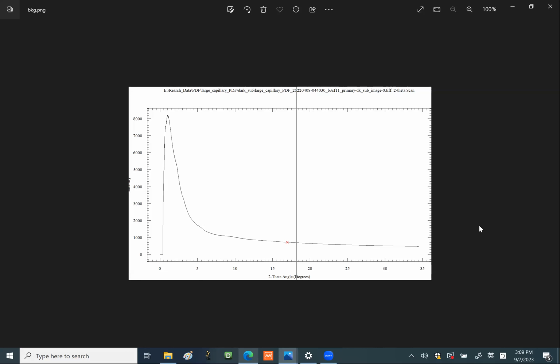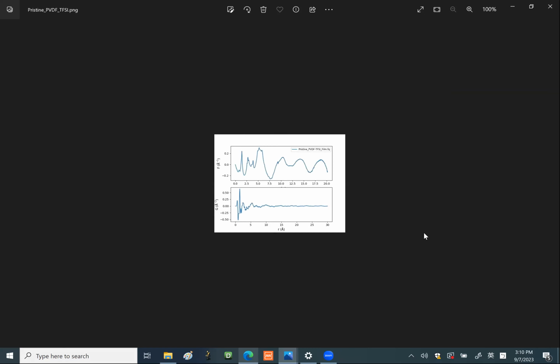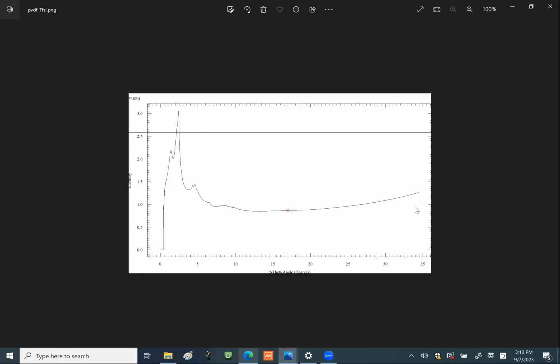Yeah, this makes sense, but you see the x-axis is 2-theta, right? Oh, you mean Q range? Yeah, what I meant is Qmax. Yeah, because the 2-theta can vary, depending on the wavelength you choose. But what we really want to use is the Qmax, which is going to be directly Fourier transformed. We do not Fourier transform the 2-theta. Yeah, I only remember that 35 number. I forgot the unit. That's my bad.